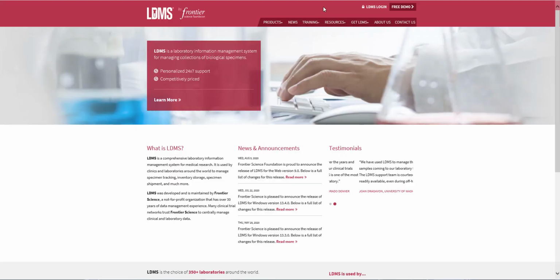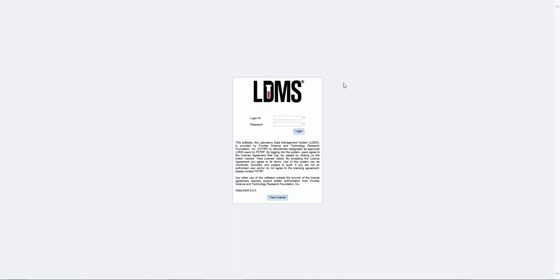In this video, we are going to discuss the use of the LDMS on the REPRIEVE project. I've started here on our public website, www.ldms.org. And to get to the application, you're going to use the link at the top right-hand corner, LDMS Login. Now, if you do not have login credentials already, that's fine. We'll discuss that at the end of the video.